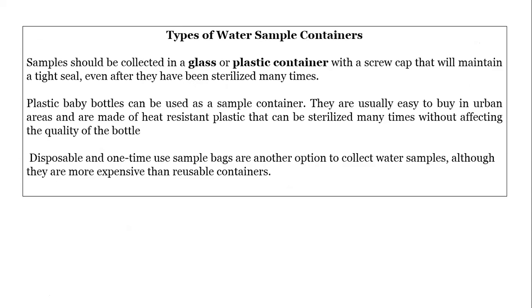Okay, type of water sampling containers. We have two types, like I earlier said. We have glass or plastic containers. So these are the two main types you can actually find to be able to carry out your water sampling.